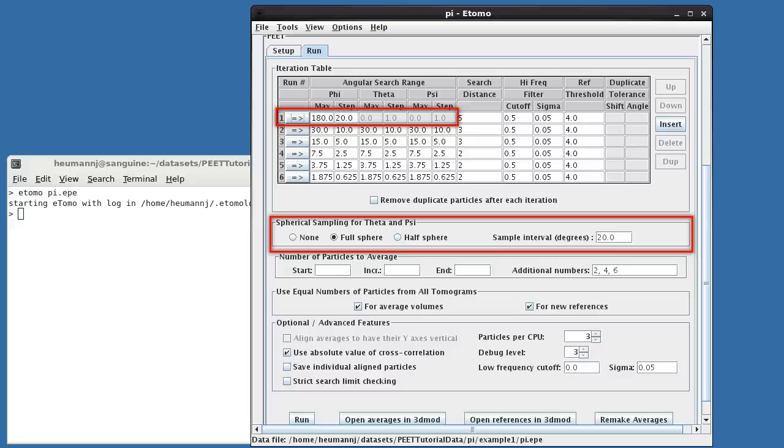To understand why, imagine a globe with points placed every 20 degrees in both latitude and longitude. At the equator, the points are well spaced, but they get closer and closer at extreme latitudes, and at the north and south poles, 18 redundant points would lie right on top of each other. PEAT provides an optimized spherical search option at the first iteration to avoid these problems. Here, you can see we've selected the spherical search option with a step of 20 degrees in phi.